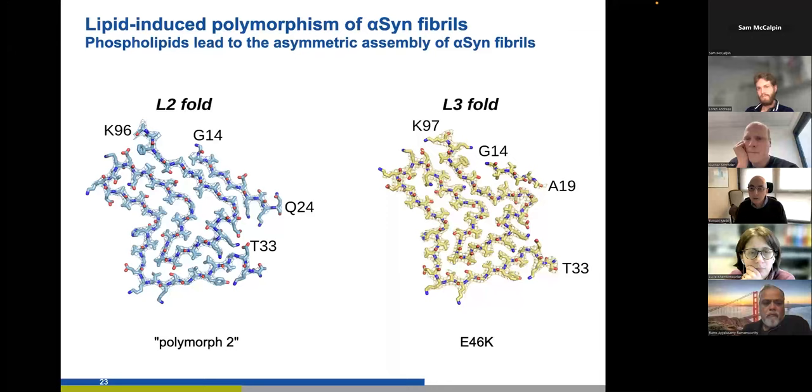Then Srijit asks, how do you determine the homogeneity of fibril sample from only TEM? Is this foolproof? The answer is yes, we do use transmission electron microscopy, and you do see differences by transmission electron microscopy at the resolution we have. But we also do a lot of limited proteolysis. And in several papers, we showed that the limited proteolytic patterns of fibrils, ribbons, fibrils 91, and so on, are very different, allow you to really distinguish. And when there is a mix, you see also that you have a mixture.